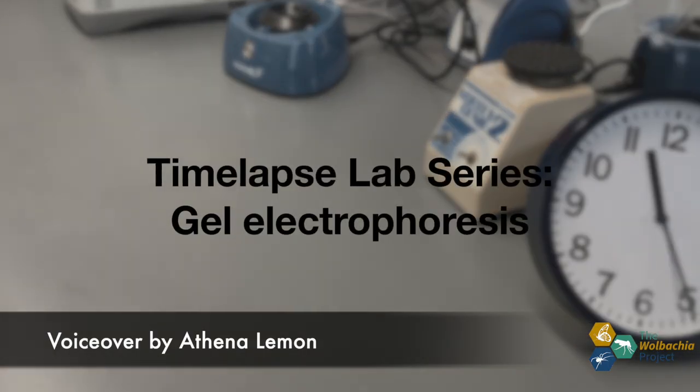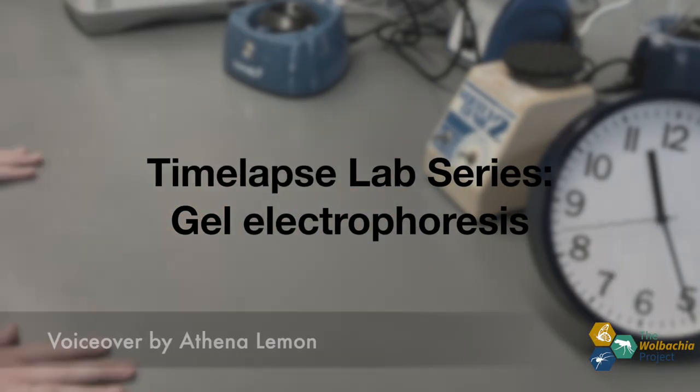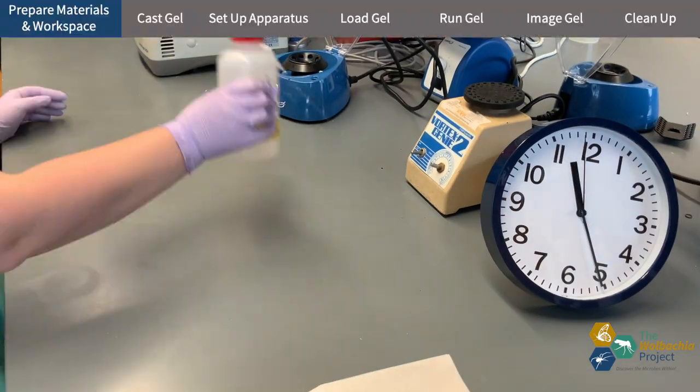Hello, this is Athena Lemon with the Wolbachia Project and today you'll be watching me set up some gels in the lab.